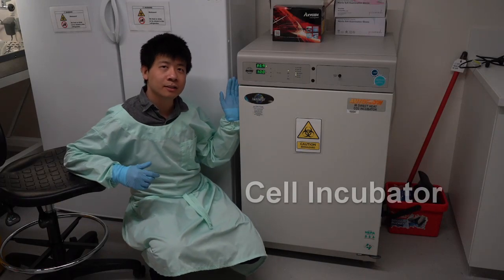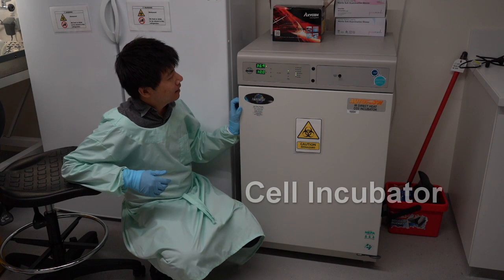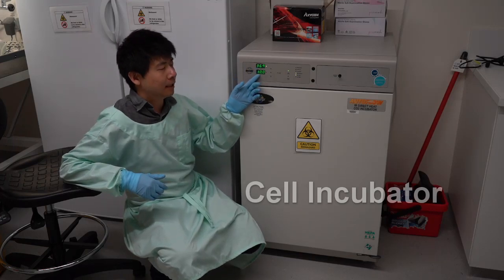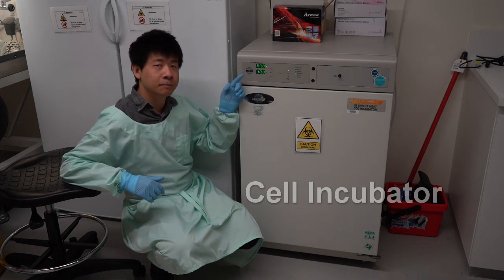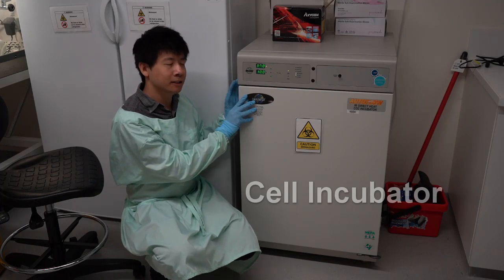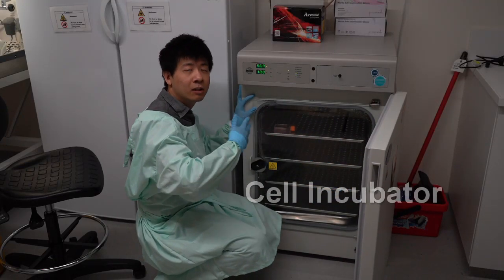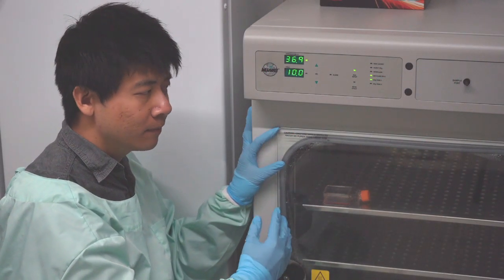This is a generic CO2 incubator where we keep the cells in culture. As you can see, it's a heavily controlled environment where we control the temperature — in this case 37 degrees — and also the carbon dioxide levels, which are set to 10%. Because the cells need to be kept happy, the environment within is maintained at heat. There are actually two layers to prevent any loss of heat, and there is condensation on the window panel.